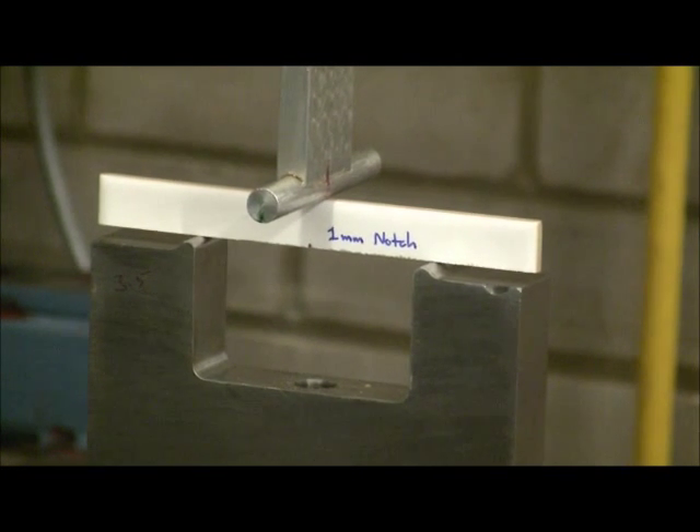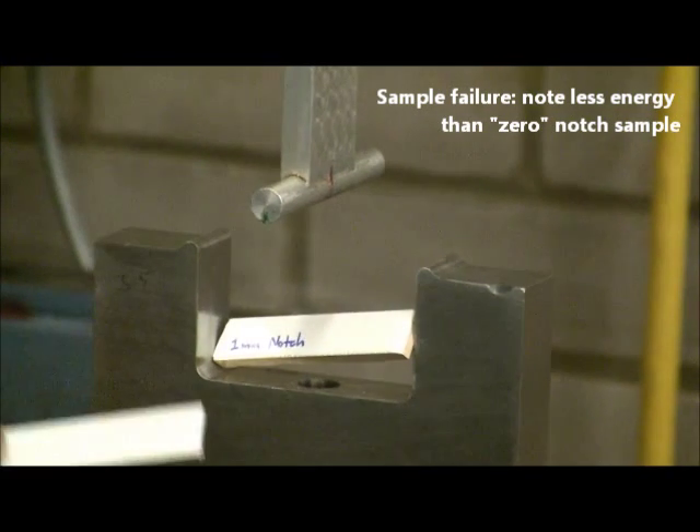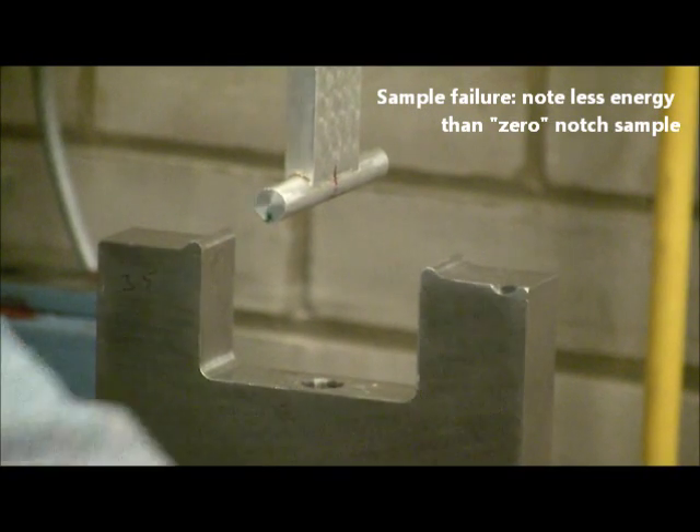Just wait for failure. So the sample has failed at this point. Here are the two halves — much less energy than in the previous sample that didn't have a notch.